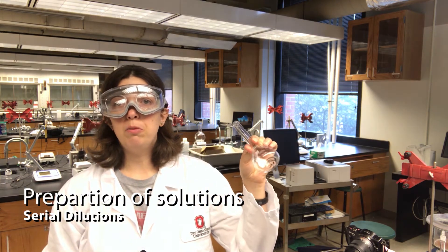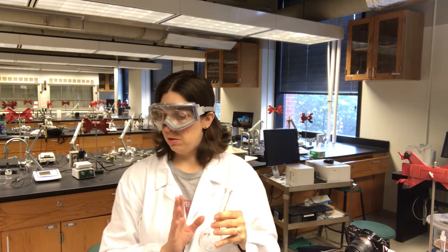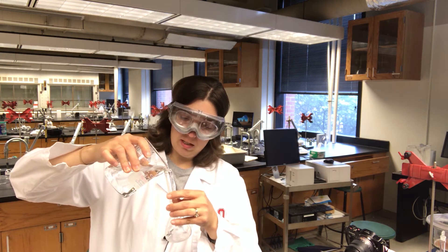I've placed some sodium chloride in my volumetric flask, and now I'm going to dilute it — or dissolve it — in some water. This is for one of my most concentrated standards.